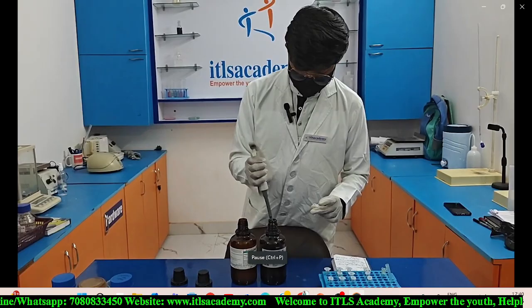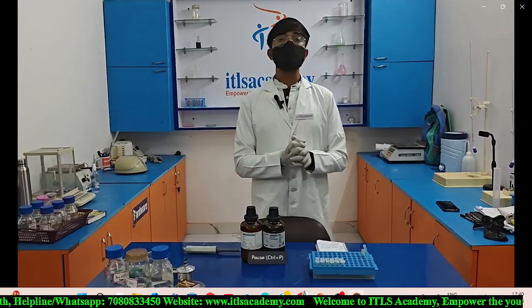So after adding chloroform and phenol to each of the eppendorfs, now we need to refrigerate these eppendorfs for 15 minutes, and after refrigeration we further need to go with centrifugation at 5000 rpm for 15 minutes. So after centrifugation we are going to see the result.